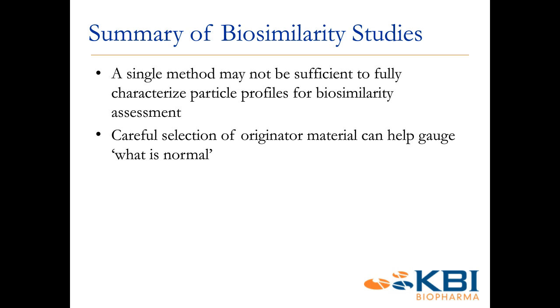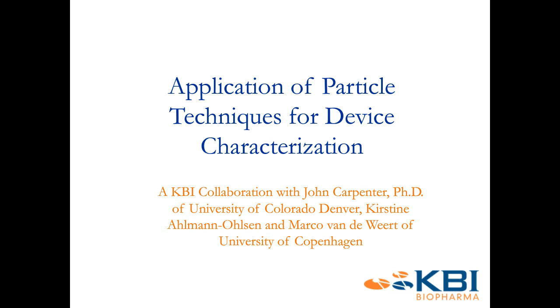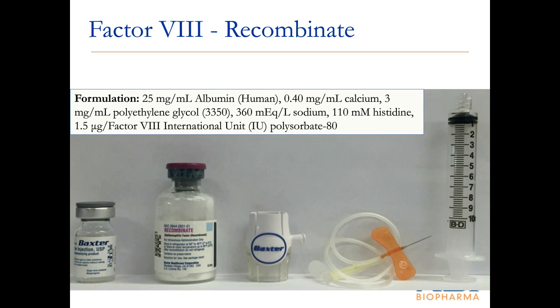So another example here. This is showing how we apply particle techniques for actual device characterization. We do quite a bit of these in our lab. This example is looking at administration techniques, and it was done with factor VIII. This image here shows the different components involved in the administration of this product.